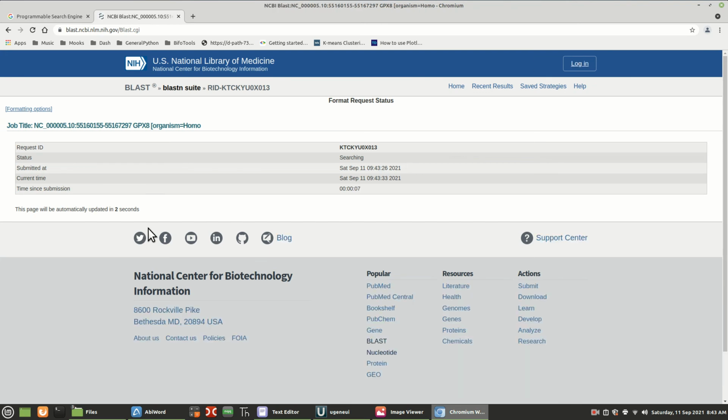Now, if they don't align very well, you have to go and look at the sequence a little more. That's why I'm saying that you need to do the alignment and look at the alignment, not just the dot plot. So you actually need to look at the letters, is what I'm saying. Let's get this in here. The last one, it should come up now. Did it with 19 seconds last time.